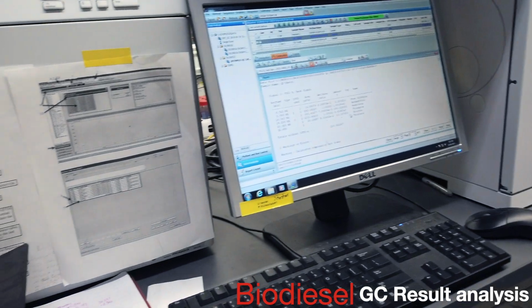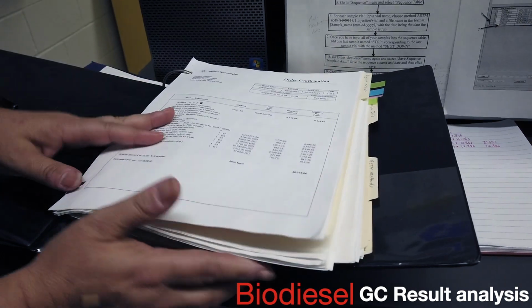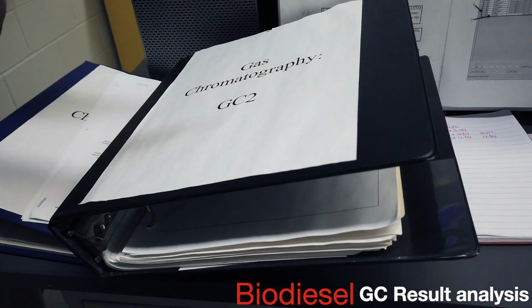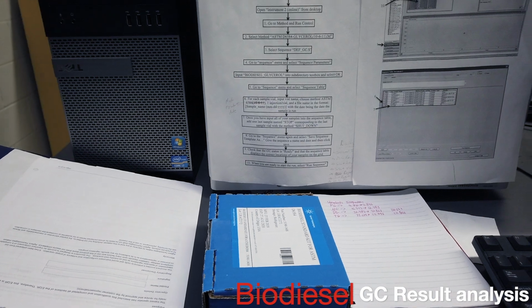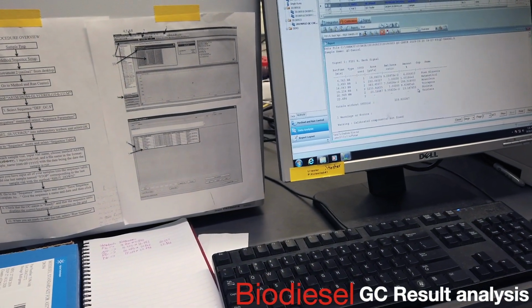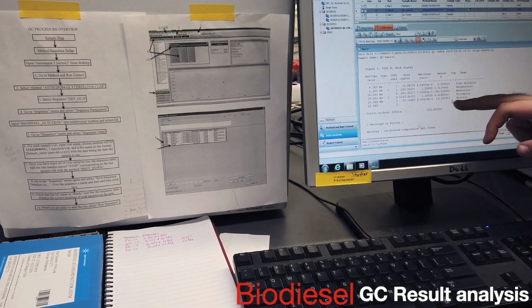So typically we just say, based on the ASTM method, wherever our tricaprin standard comes out to be, we know monoglycerides are going to be short of that, diglycerides are going to be just past that, triglycerides are going to be a couple minutes past that. So we have good news. It passed. The units are all off, so we're going to have to figure the math out. But this is giving me something that's at least near.